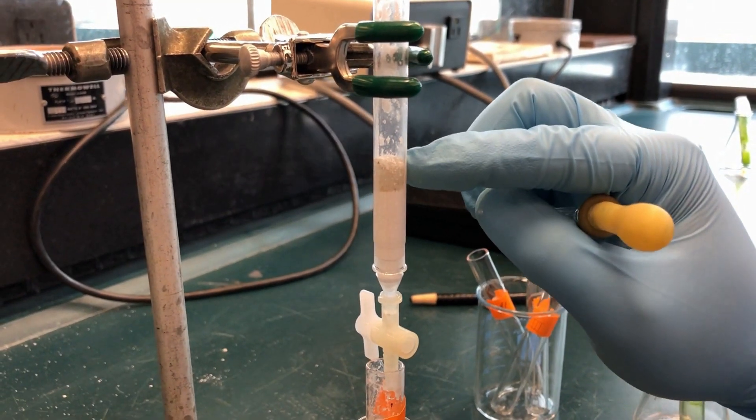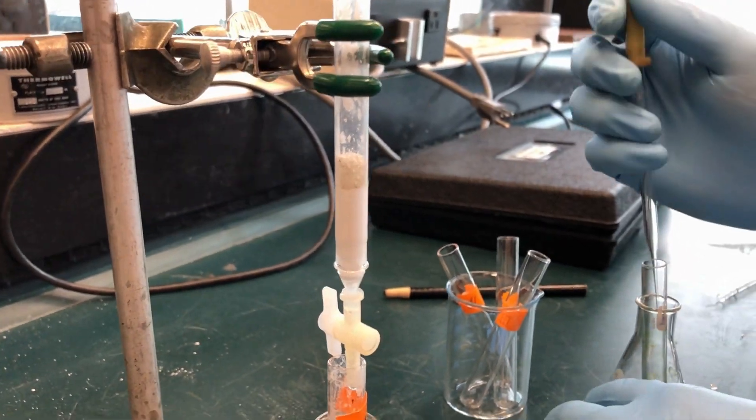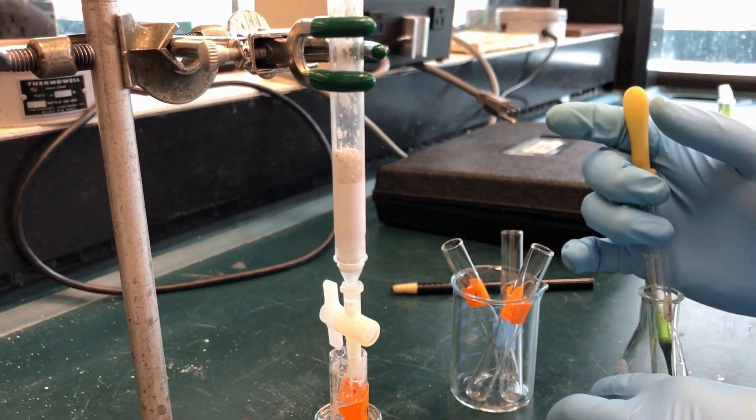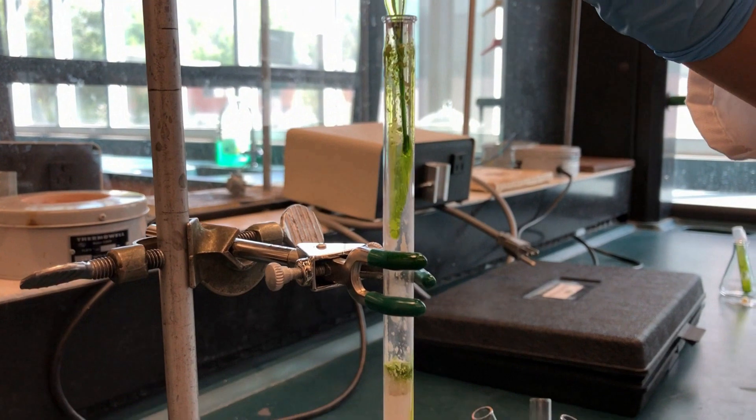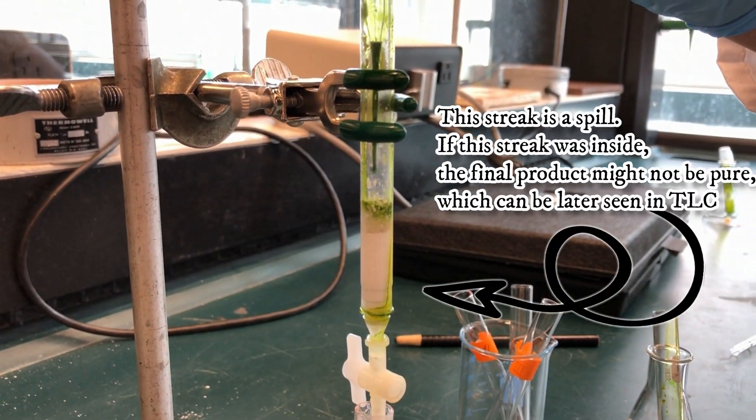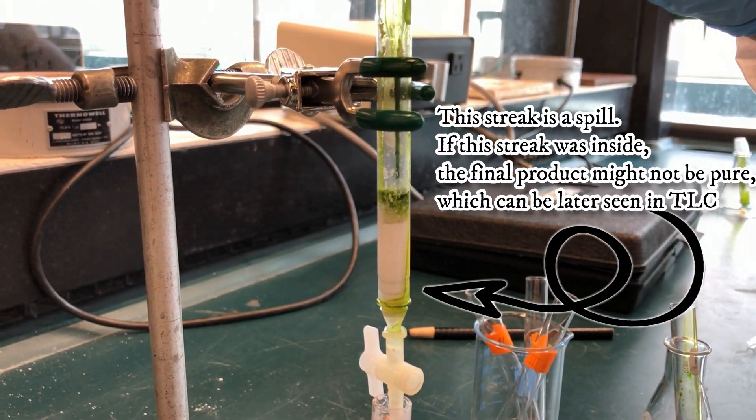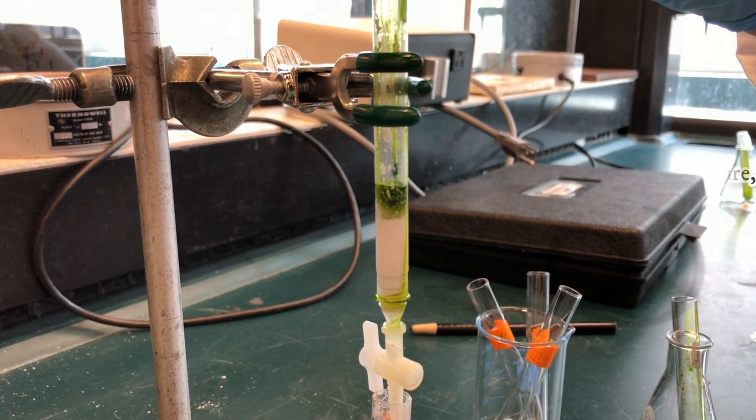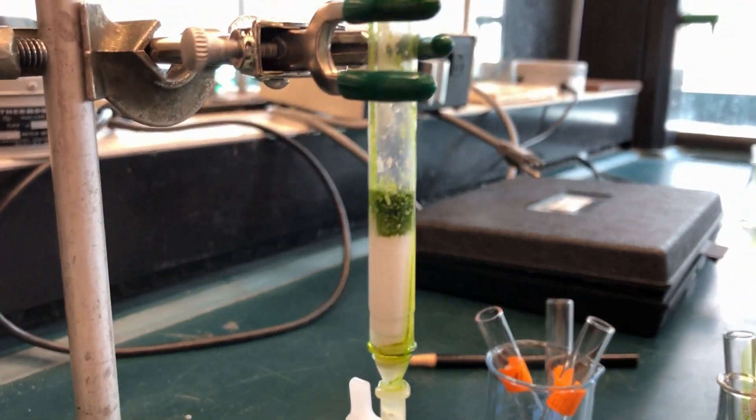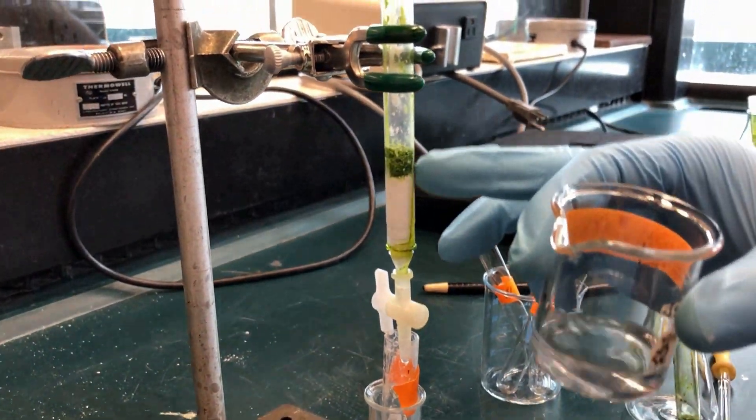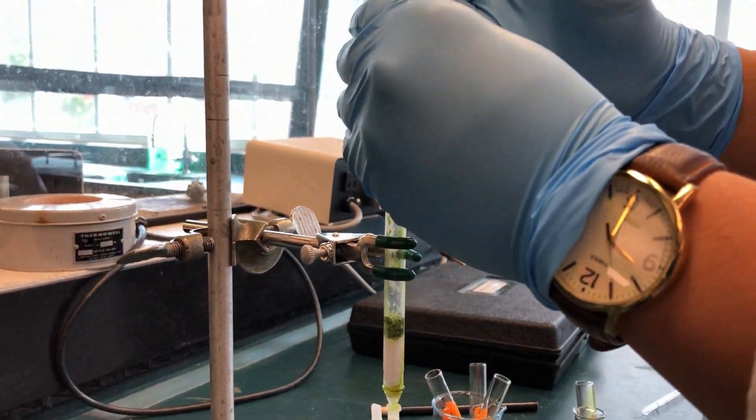Once the remaining petroleum ether is nearly absorbed into the sand, add half of the green pigment to the column. Make sure the column does not get dry. Once the green solution has seeped into the alumina, add more petroleum ether.